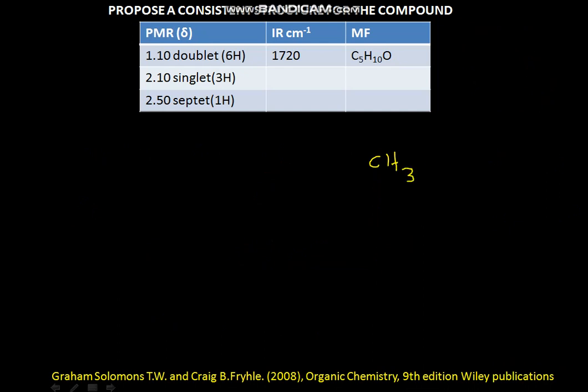So we have a rough case of having methyl, and it is a doublet, meaning the neighbor is having one methine group. That is why these 3 hydrogens couple with that one hydrogen and show a doublet. There are 2 sets of methyl present, therefore this could be CH3. So now this is consistent with the first data. 3 protons coupled with the methine proton and therefore show a doublet.